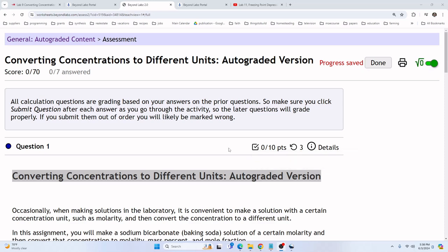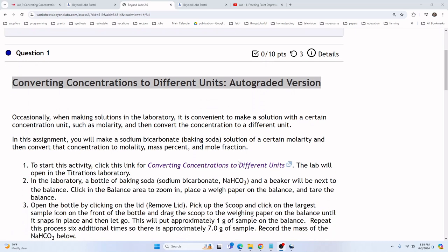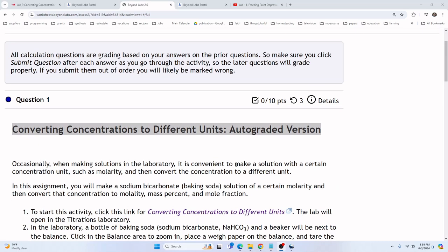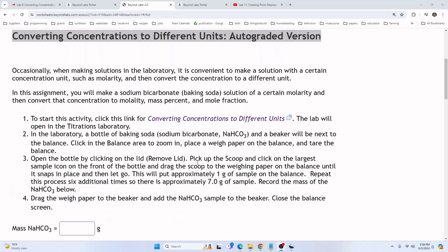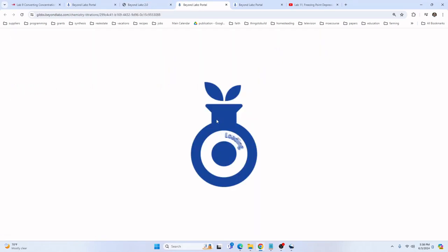Hello students and welcome back. In this lab, we'll perform Lab 9, converting concentrations to different units. Let's get started by clicking on the link.